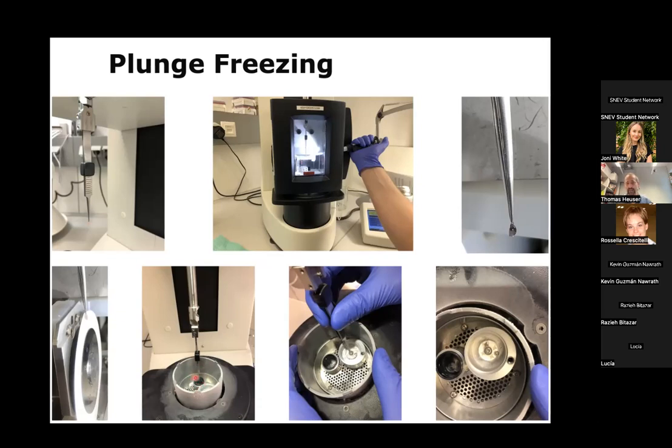And what's happening under these conditions is you're shock freezing your grid. Meaning if I would put my cup into a freezer, at around 0 degrees Celsius, the water molecules would rearrange. They form this highly ordered ice crystal, and this takes up more space, and my poor little cup would probably break. And the same would happen to EVs and all other biological samples.